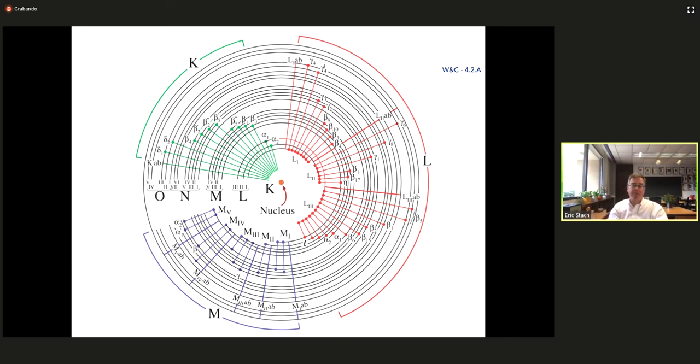So it's incredibly powerful, the fact that you can just do this bing, bing, bing, bing, bing, all right? High resolution TEM, if you're operating in the diffraction and bright field mode, the phase contrast mode has the lenses all set up the same way, nothing to it. The STEM mode, usually it takes a couple minutes to go from the phase contrast mode to the STEM mode because you have to kind of re-optimize the condenser system. Back when I was younger, it took a long time, but the modern microscopes are so stable that you generally just load a pre-existing alignment and it's pretty close, and you tune one or two little things. Takes, for a good person like myself, a minute or two, and off you go, you're doing STEM.